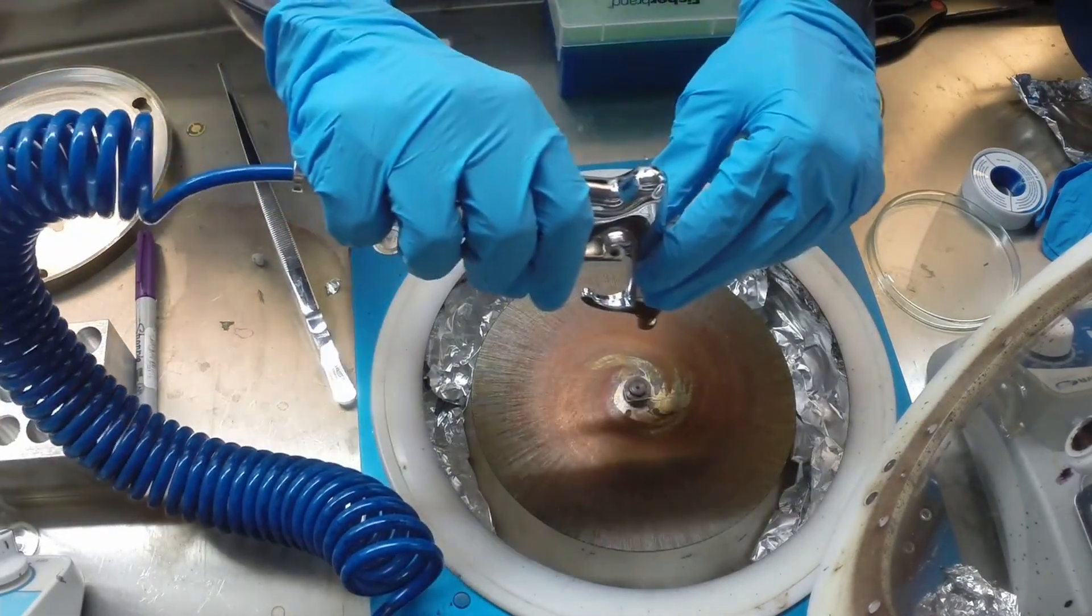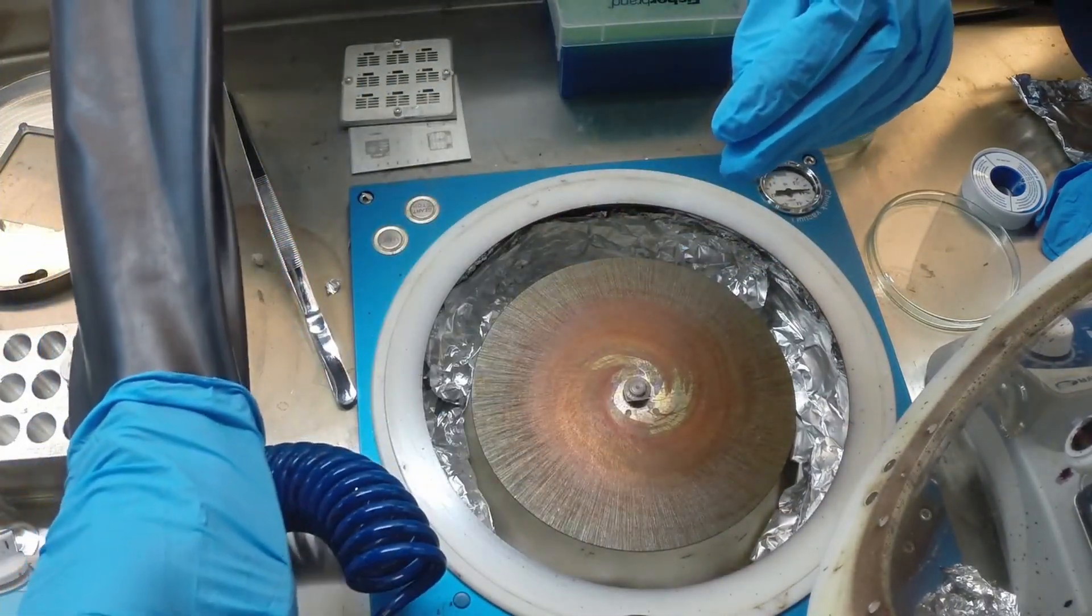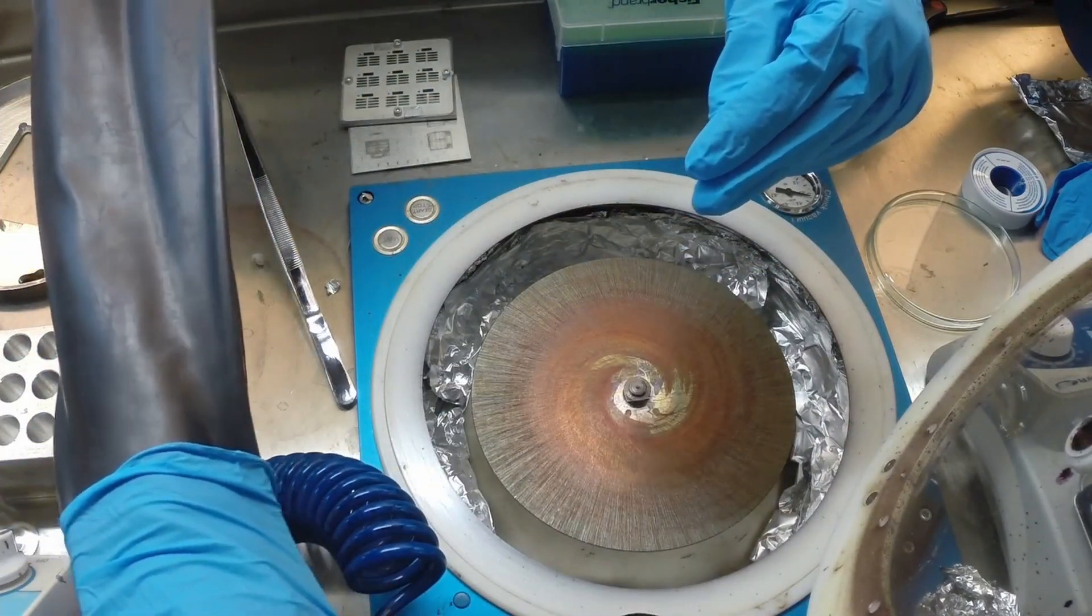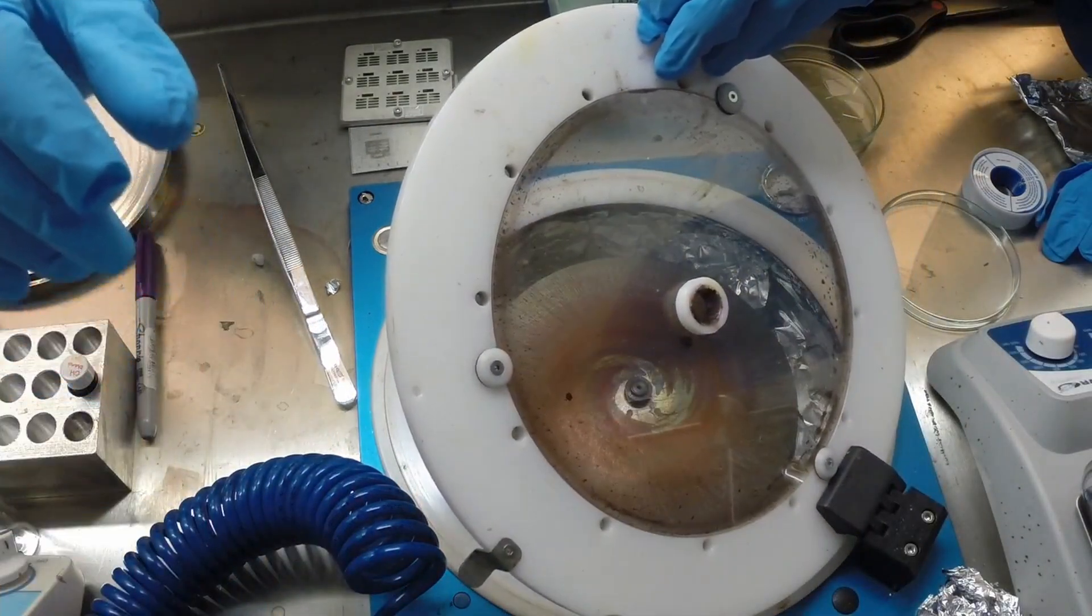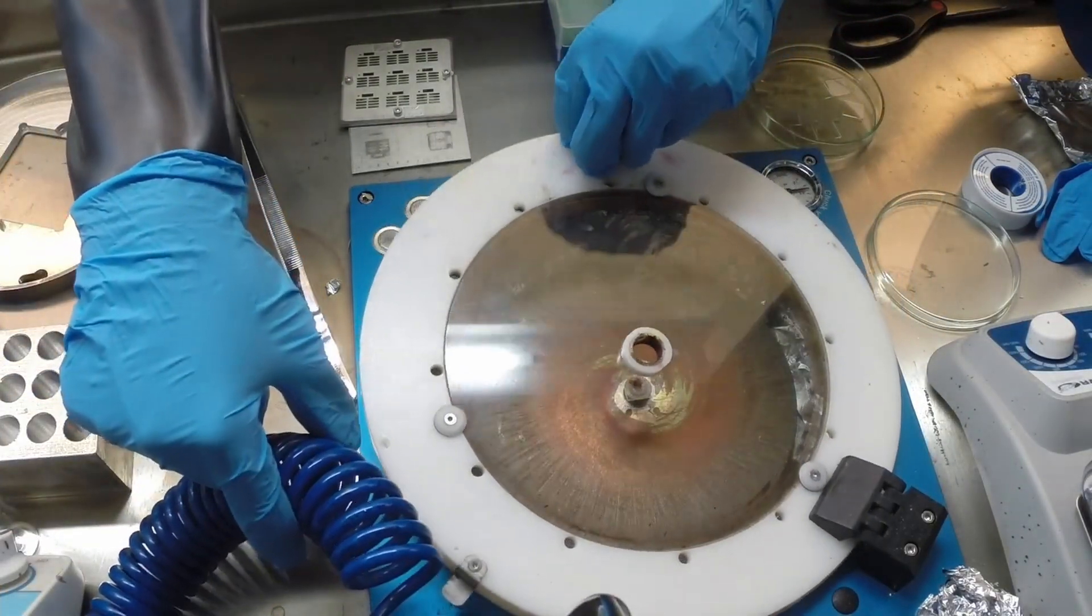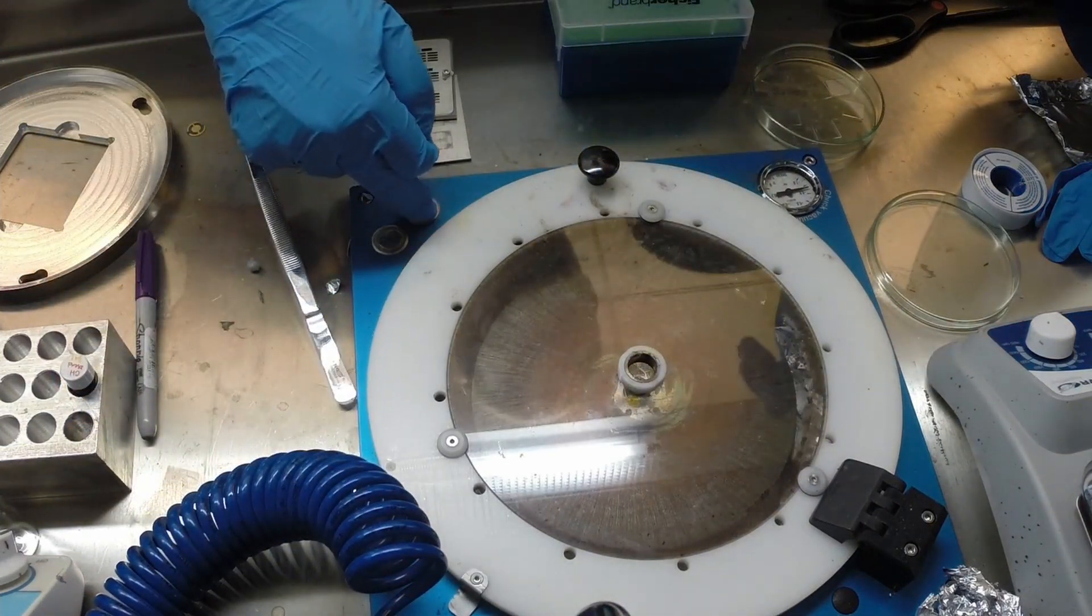Then we'll blow off any dust from the substrate with the nitrogen gun, close the lid, and perform a dry run by pressing the round start/stop button. The purpose of a dry run is to confirm that all spin coating parameters are correct.